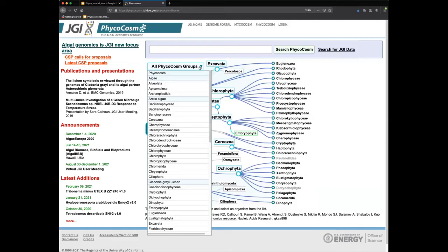This menu is for accessing various groups of genomes. This pull-down menu is color-coded to indicate the kind of genome group. The majority of groups have no color. These are what we call phylogroups, meaning the group is defined by phylogeny. Every node and leaf in the Navigator cartoon is listed here in this menu as a phylogroup.